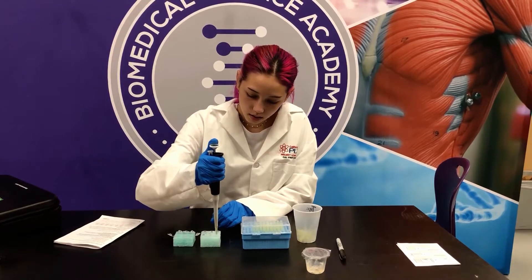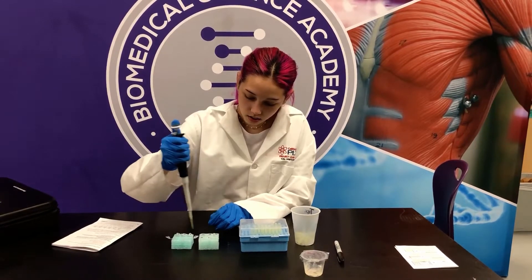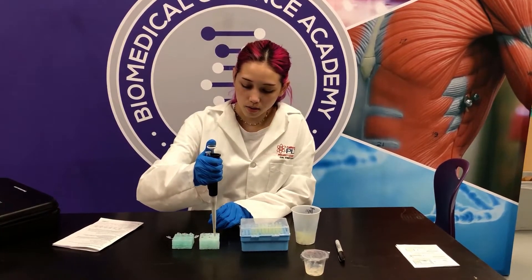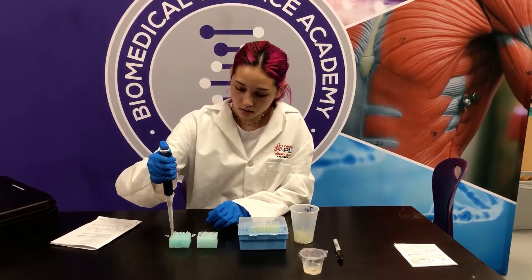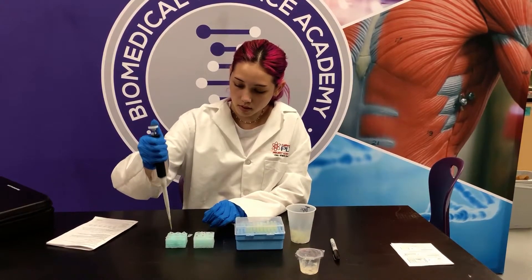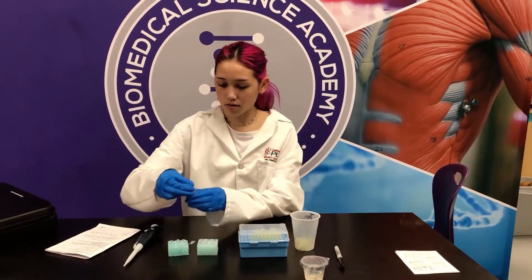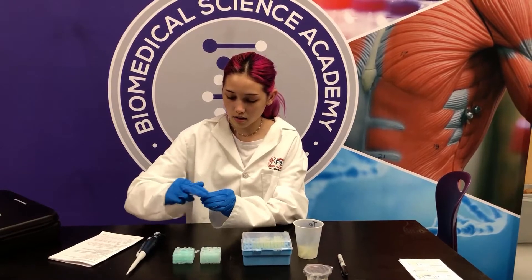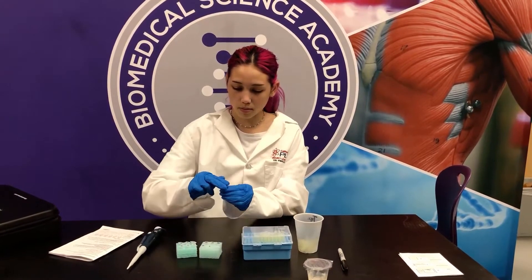I'm going to do it again, put it into tube number two, and do it one more time for the third one. Then I'm going to get rid of this tip, put this back down, close all of the tubes and put them back, and close missing person number one as well.